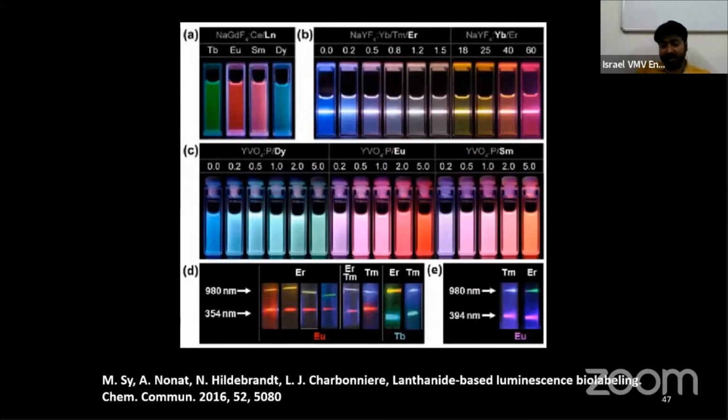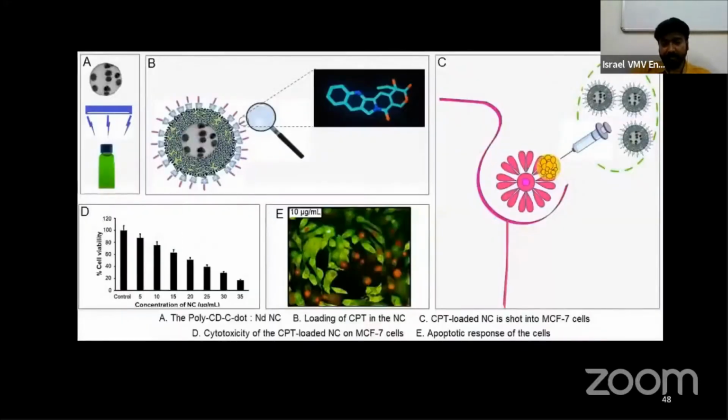In the case of lanthanides, lanthanide nanoparticles are preferred nowadays. That's why the metal nanoparticles remain much unexplored. Apart from gold, silver, and platinum, you can explore others. Those who want to explore any metallic nanoparticle can get involved in studying them, and many applications can be derived just by studying the ultraviolet-visible-NIR spectrum.